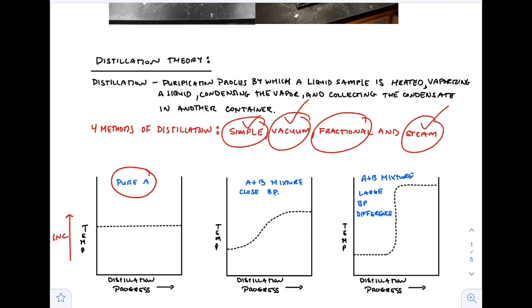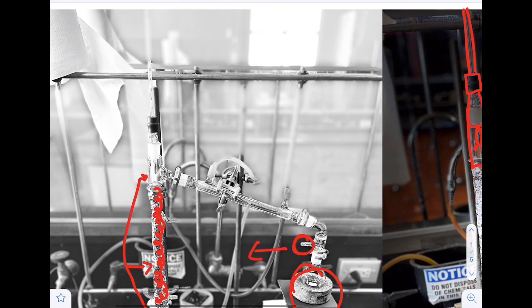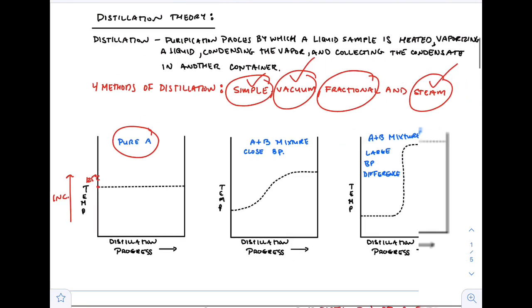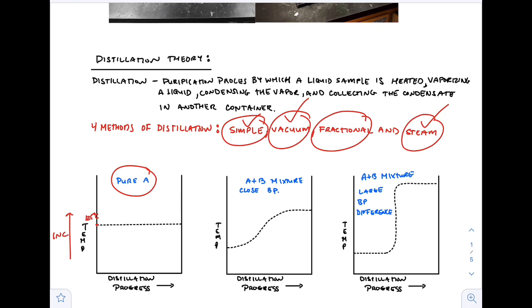Then temperature. If we have a pure sample A, then the distillation process is going to heat until it gets to a temperature, let's say 125 degrees Celsius. The vapors, as we would see on this thermometer right here, are going to stay at 125 degrees the whole time. That's just the inherent characteristic of a pure substance, right? They have a constant boiling point, and it remains the same throughout the whole distillation process, 125 in this case.